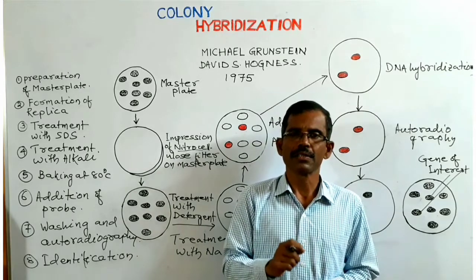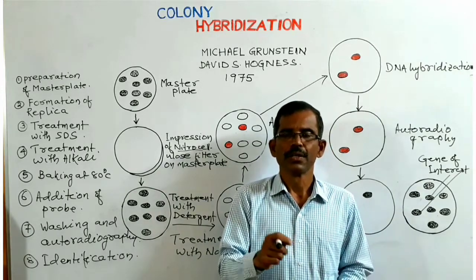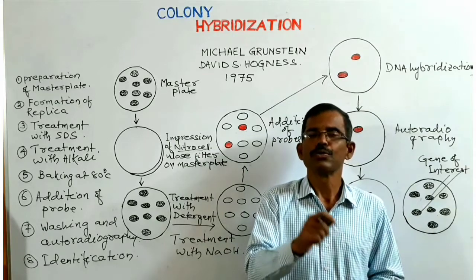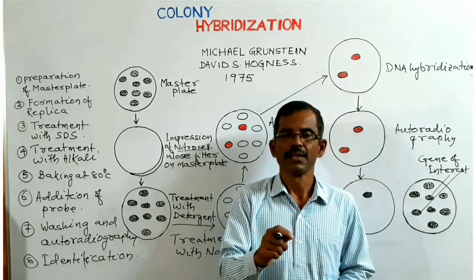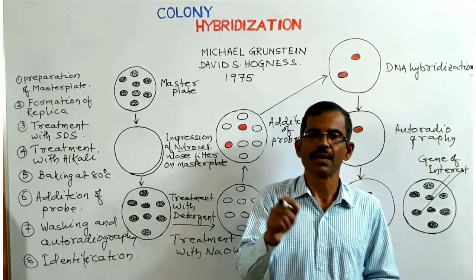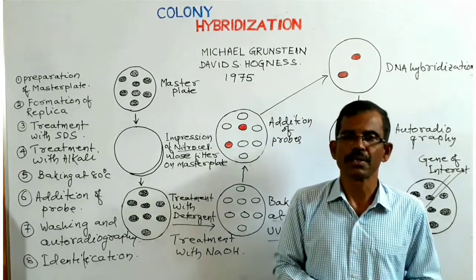Colony hybridization is a blot analysis technique in which bacterial cells are transferred from a solid nutrient medium onto a nitrocellulose membrane for further analysis. It is a very simple but powerful technique useful for screening gene libraries. So friends, this is about colony hybridization.